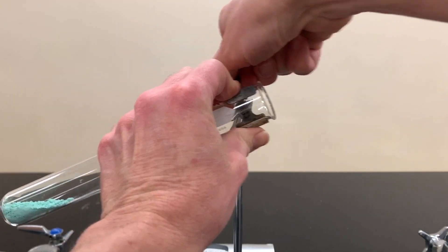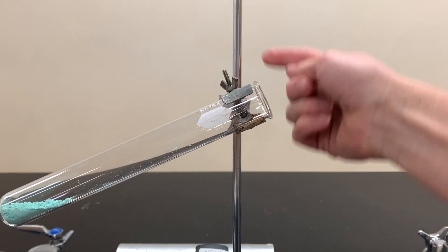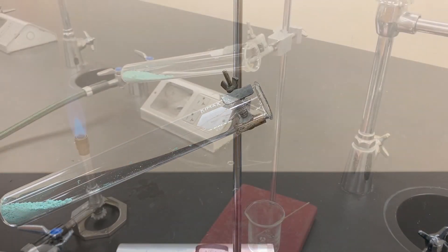You can also adjust the height at that point, and then we're going to be heating with the Bunsen burner gently underneath this area in the next step.